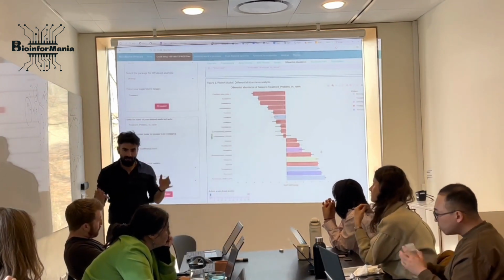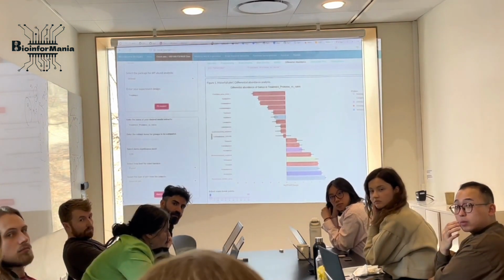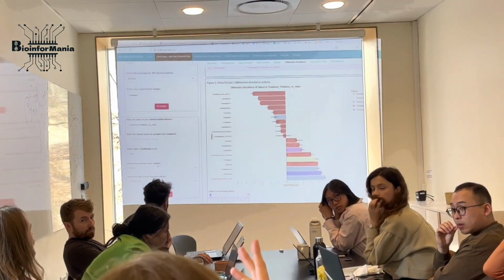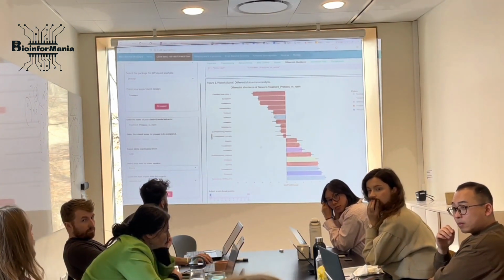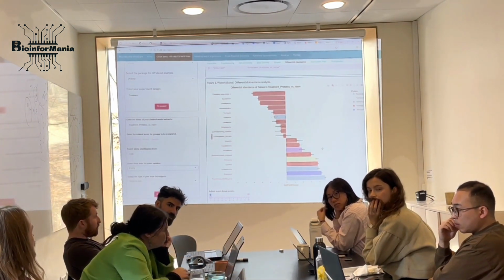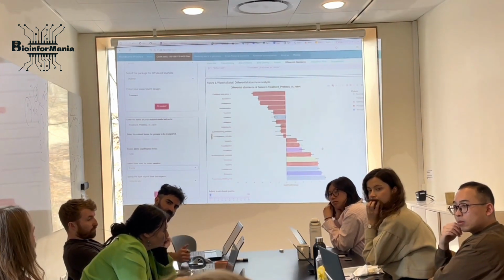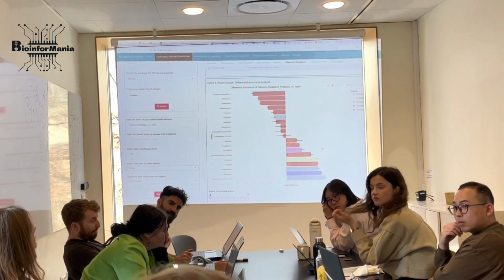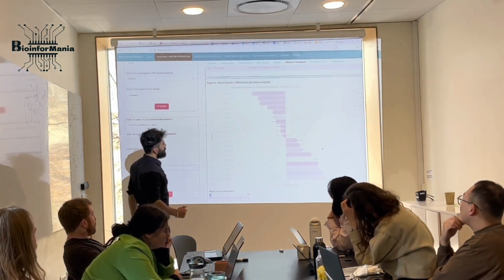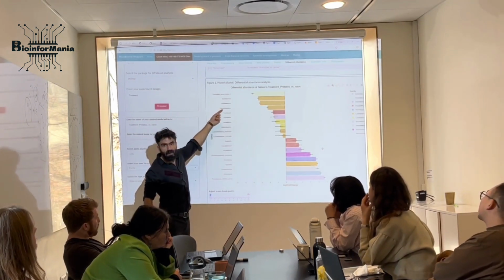Right with me. I have a question. If it's similar to the RNA sequencing data I was working with previously, so protozoa here is like the housekeeping genes. Then we have something like the default, and we want to compare it to that default. We know the results for that species, or precisely, yes. So in the gene expression here, each of these is one of your genes, okay?